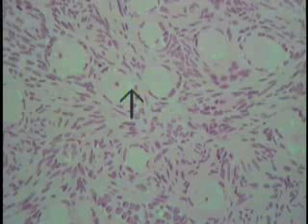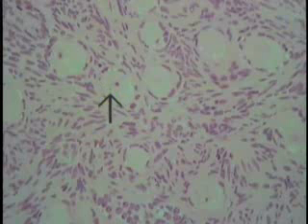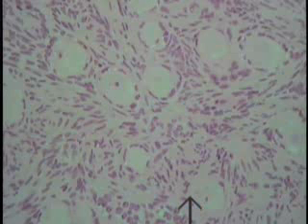What can be demonstrated in this particular field is the cytoplasm of a cell, the nuclear envelope, which begins at approximately this location, indicating the nucleus located here, and then this dense round structure within the center of the nucleus actually represents the nucleolus. Similar structures can be seen in this particular ovum as indicated by the pointer.